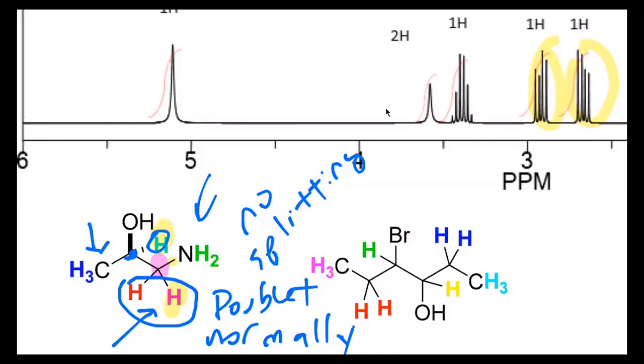Okay. So you'll count the CH3 and the CH2 for this proton simply because those 2 carbons that are neighboring have hydrogens on them that can split with that proton.